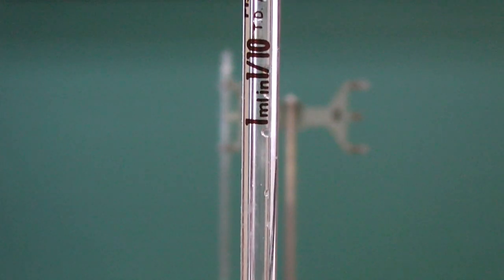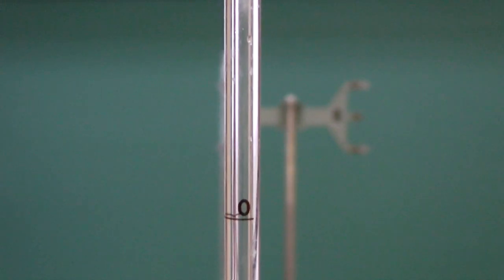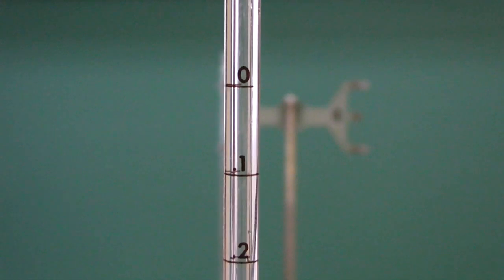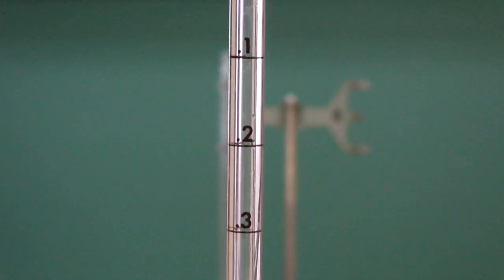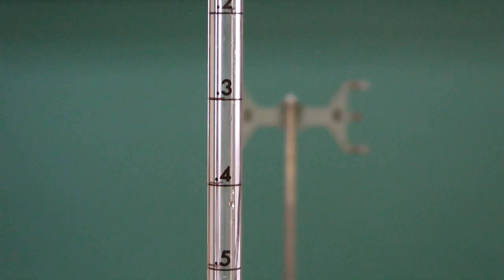This is the 1 milliliter mohr pipette. As you can see, it has increments every 0.1 of a milliliter. Don't forget to read one more decimal place, therefore to two decimal places, when using these pipettes.